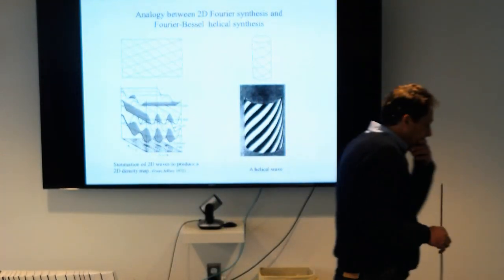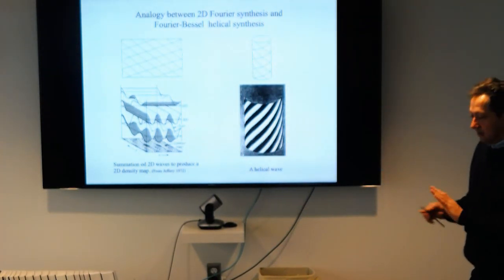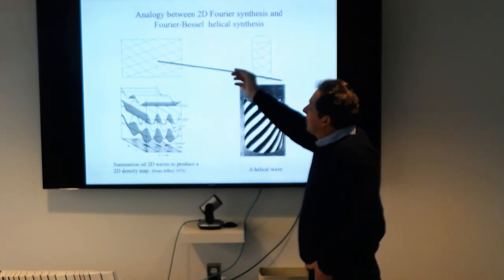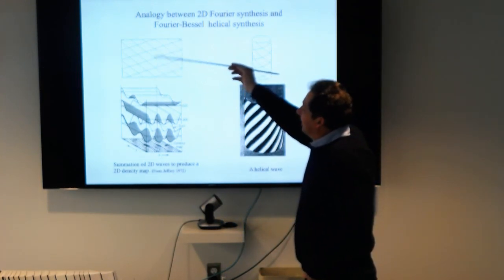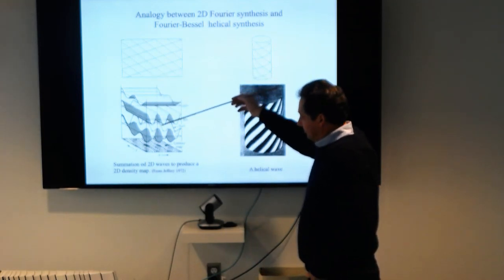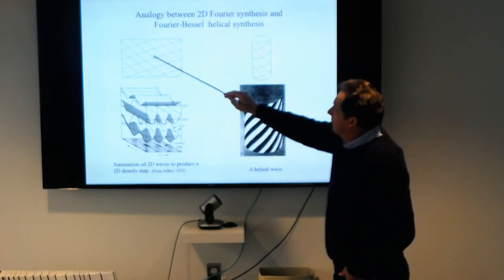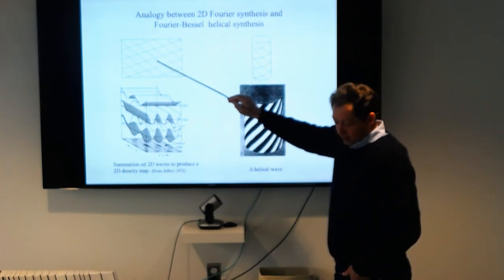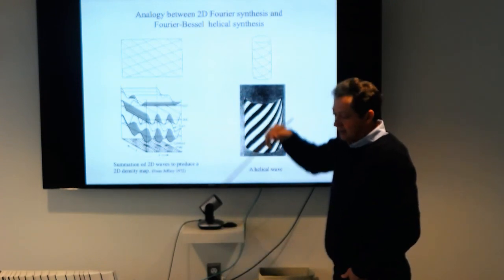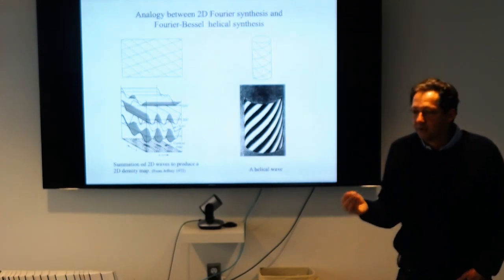So another distinction with a 2D lattice. You can think about a 2D lattice and think about the Fourier theorem: you have a lattice with some unit cell here that has been drawn, and then you can think of it as a two-dimensional function or a three-dimensional function, right?